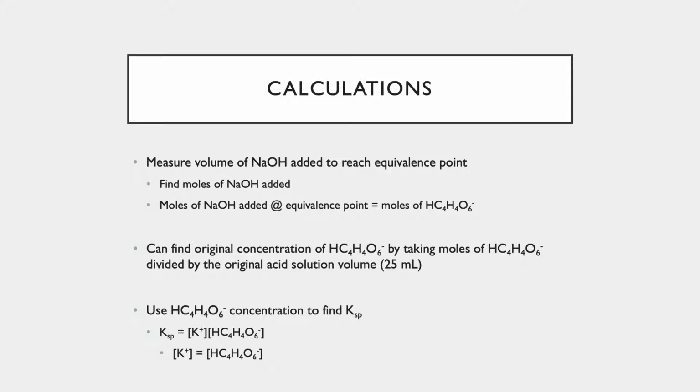And even if you end up doing more than 3 titration trials, like if you want to do 4 or 5, just to try to get all of them really accurate, you can still do all of those in a pretty reasonable amount of time. And then the calculations afterwards. I think hopefully this gives a nice outline for what to expect.